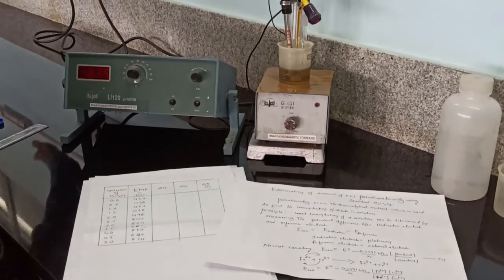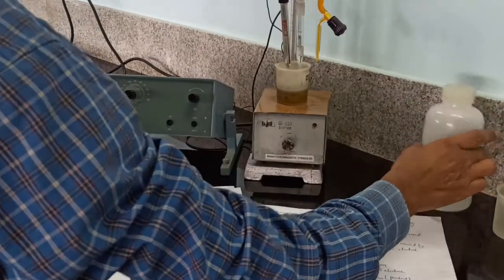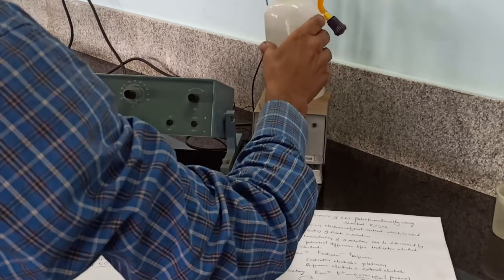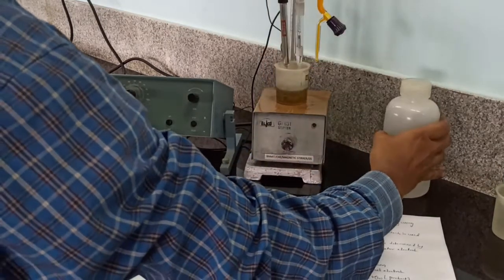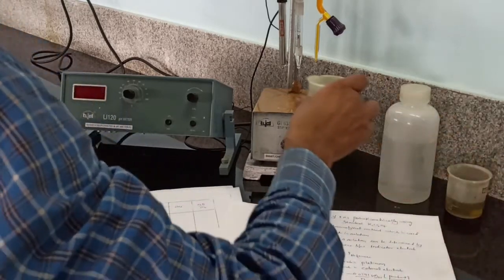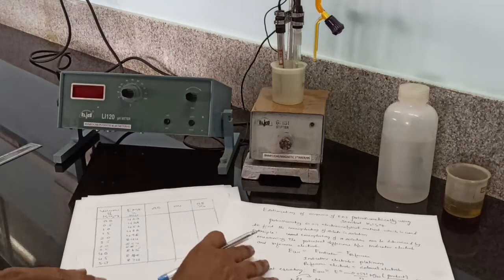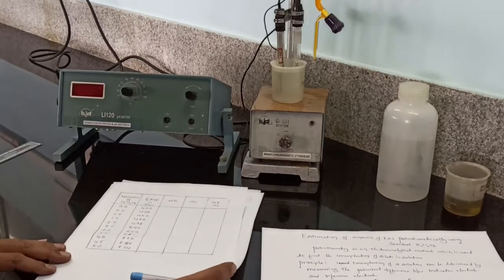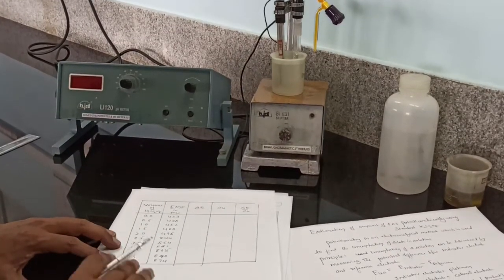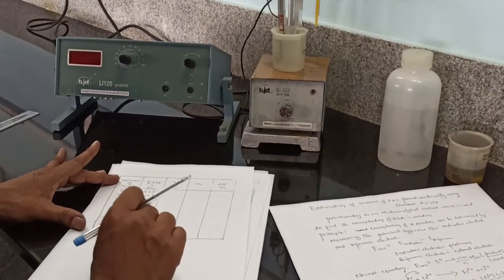First switch off the instruments, wash the electrodes and keep the electrodes in distilled water. Using this data, we have to find the equivalence point. To calculate equivalence point, we have to use derivative graph.